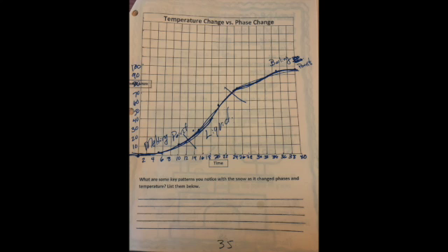All right, the last part of our lesson here. This is what you have to do in your packet. So we take a look at our packet here. You can see that I put my intervals down for my time. I went 2, 4, 6, 8, 10, 12, all the way up to 40 minutes. Then for my temperature, I went up by intervals of 10, 20, 30, 40, 50, 60, 70, 80, 90, and to 100.